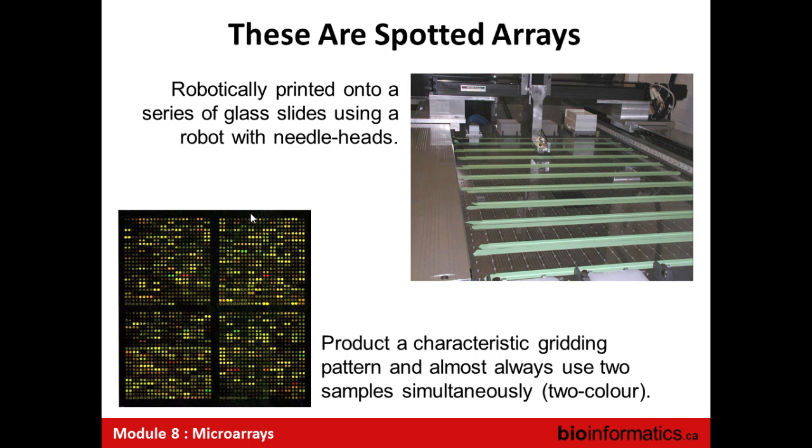About 18 months ago, Affymetrix released a new human array, which had more spots and a higher spot density than anything they'd released before. And similarly, Illumina released a new genotyping chip at that time as well, which was denser than anything they'd done before. So that's 18 months ago. I don't know if there's another iteration or version of them that is denser. Both companies seem to be focusing on reducing the amount of input sample and view that as a strong competitive advantage versus sequencing. I'm speculating. For example, you can do a genotyping array from a few nanograms of material, and you probably don't want to do a reliable sequencing experiment with less than 200 or 250. So that potentially allows you to access a biopsy-based market. That's pure speculation.